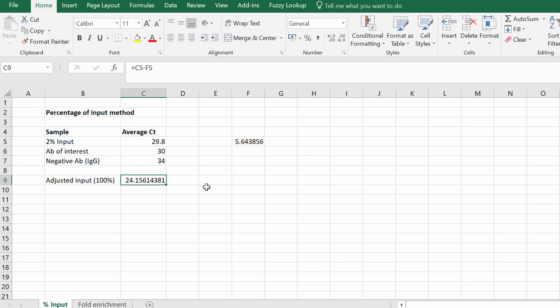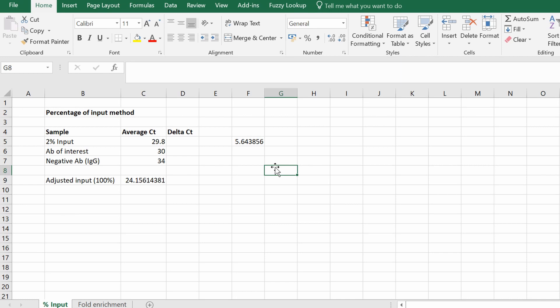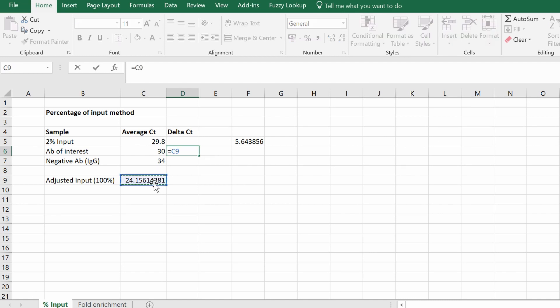This adjusted input CT value now represents 100%. The next thing we need to do is calculate delta CT. I'm going to create a new column called 'delta CT'. Delta CT is the difference between the adjusted input CT value and our samples of interest. I'll start with the antibody of interest: type equals, select the adjusted input CT value — which now represents the 100% sample — minus the CT value of the antibody of interest, then press return.